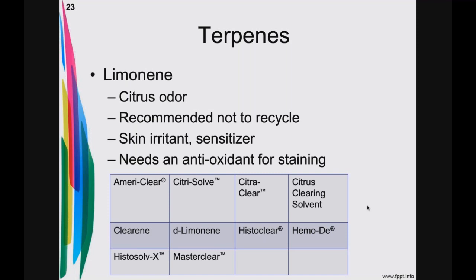Here's a list of what's on the market right now. I did my best to include everybody out there, but all of these names, some of them make it common sense. D-limonene was really one of the first, as well as Hemo-D. All of these guys smell like oranges or the citrus families. Some of them have mineral spirits added because orange oil is very oily and greasy, and that would make it difficult during cover slipping. So there's some variation on the brands out there.